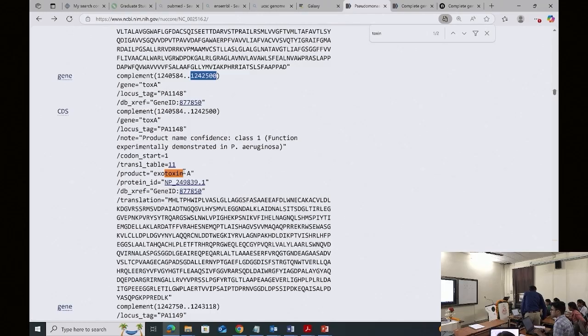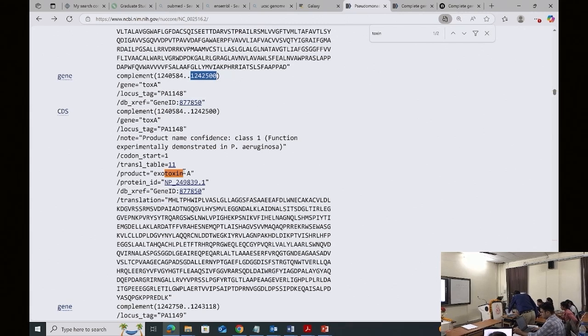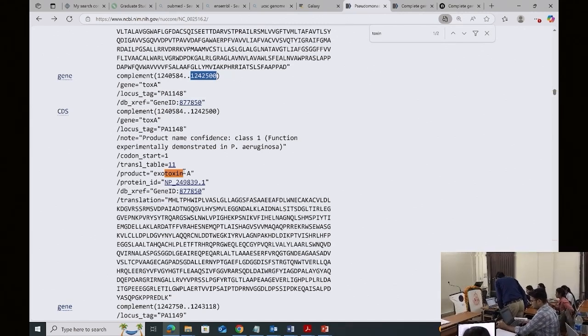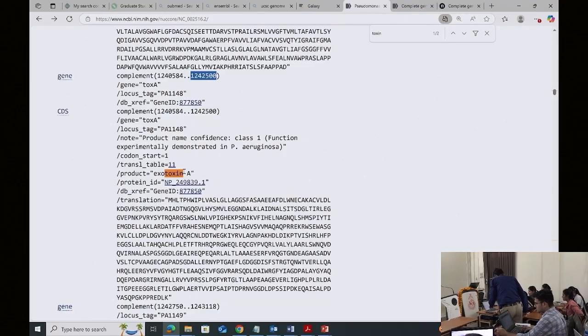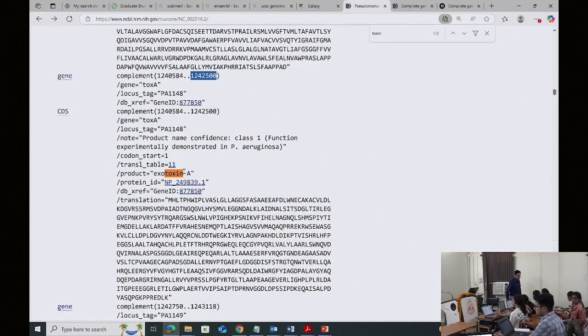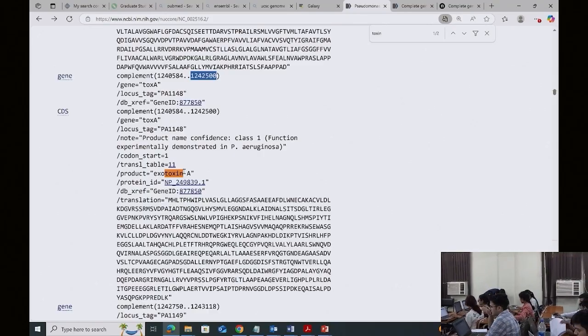Did you find? Yeah. Okay, good. So, then click on FASTA. Yeah, click on FASTA. Okay. So, start is ATG and go to the end. Stop is TAA. Yeah, very good. So you got it. So start is it. Oh, sorry. And stop is, very good. Yeah. Did you get this?